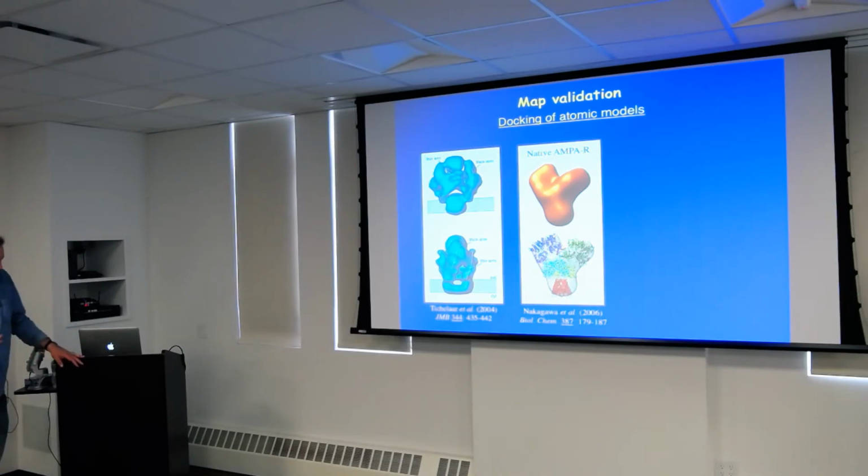So for membrane protein people, detergent is always iffy. Because if you use harsh detergents, it can actually affect the transmembrane domain. And there are famous examples where the structure is really modified by the detergent. So what people do, they use so-called mild detergents, which are usually long acyl chains and large head groups, that try to be very mild to the protein and to keep it in the correct conformation. You can never be sure as long as you have detergent.